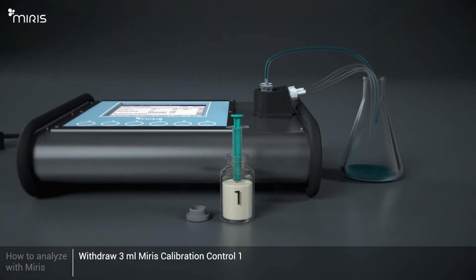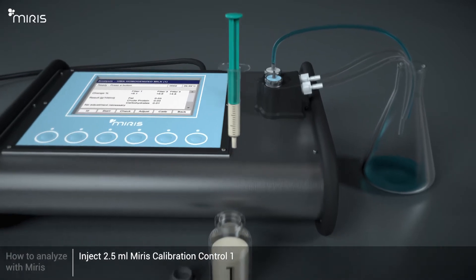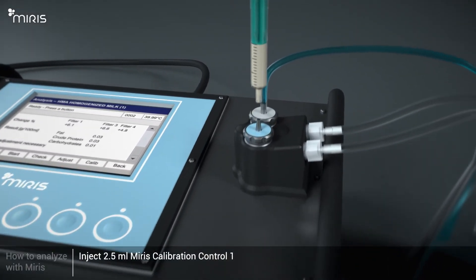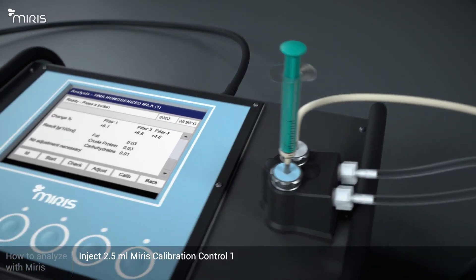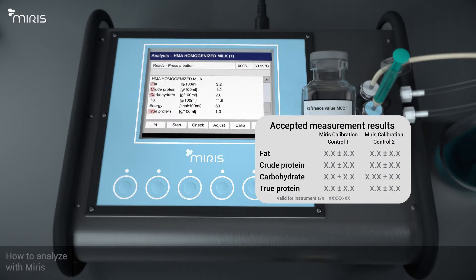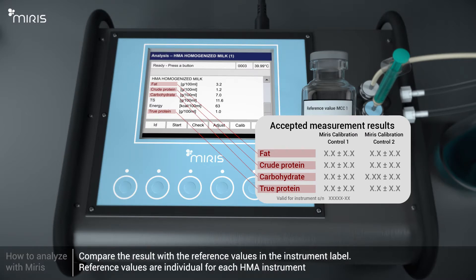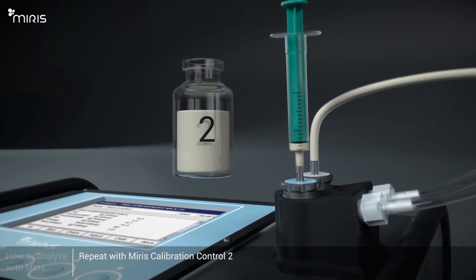Withdraw 3 millilitres of Meris Calibration Control 1 from the bottle. Inject 2.5 millilitres of Meris Calibration Control 1 and leave about 0.5 millilitres in the syringe. Leave the syringe on the inlet. Select Start to begin the validation. Wait approximately 60 seconds. Compare the Meris Calibration Control result with the reference values on the vial label. Repeat the validation procedure with Meris Calibration Control 2.